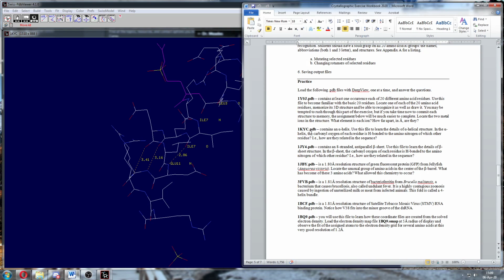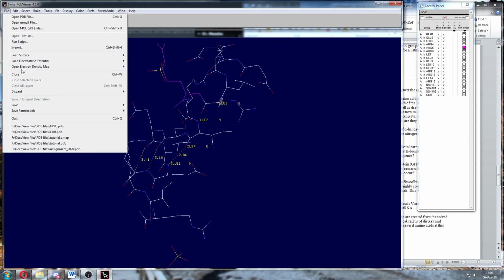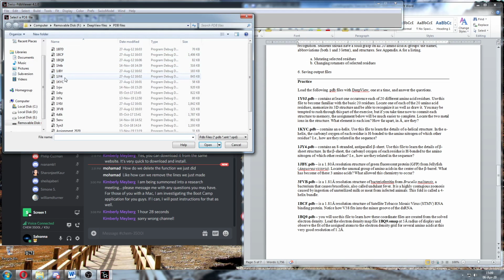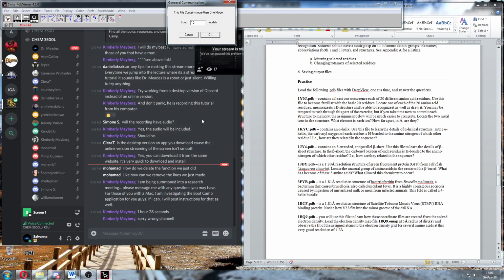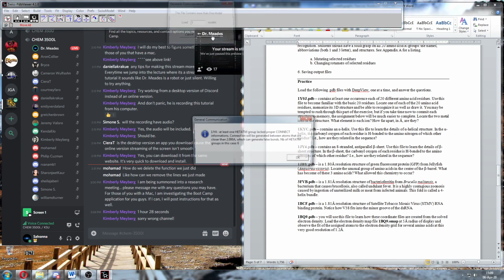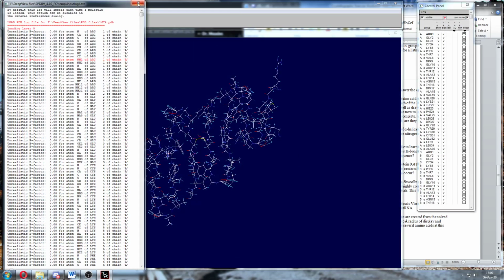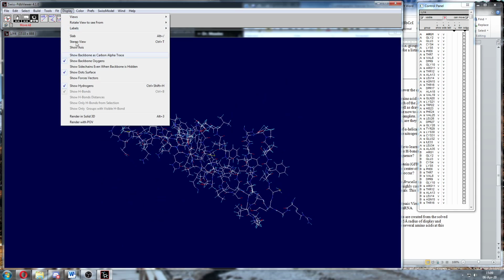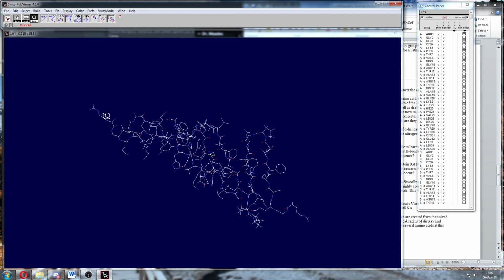Okay. All right, so that's our alpha helix. We're going to do the same thing with a beta sheet. So 1JY4, so I'm going to go to File and close this one and open 1JY4. Right, this was again done by NMR. So we load one model. Right, and again we show all those hydrogens, so we can go up to display and turn off the hydrogens.